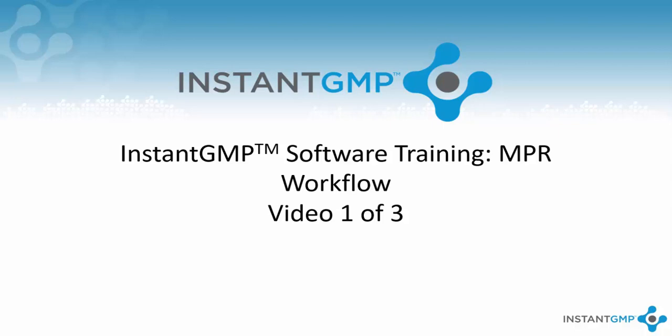Hello, and welcome to Instant GMP's training on MPR workflows. This will be an in-depth look at the creation of an MPR and the prerequisites to its creation. In this video, we will be focusing on prerequisites which include adding materials both used in manufacturing and manufactured, establishing specifications for those materials, and organizing products into projects. This is video one of three.